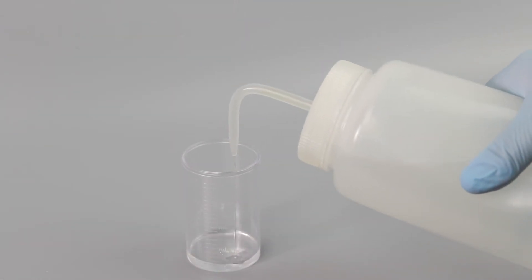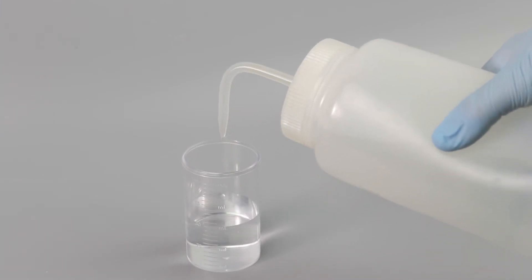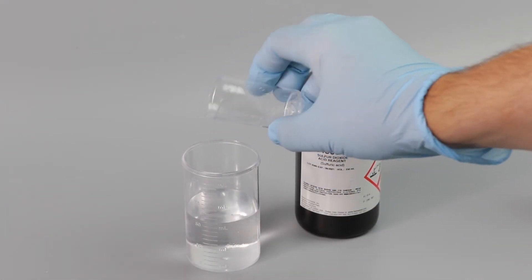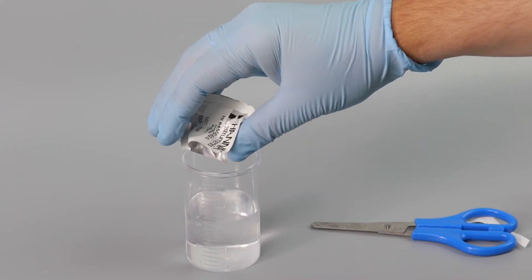Next, add distilled water to the 50 ml line. Afterwards, add 5 ml of your HI84500-60 acid reagent and one packet of the HI84500-62 stabilizer.